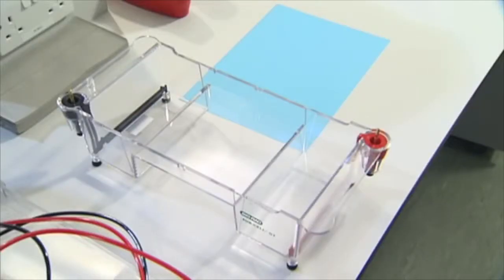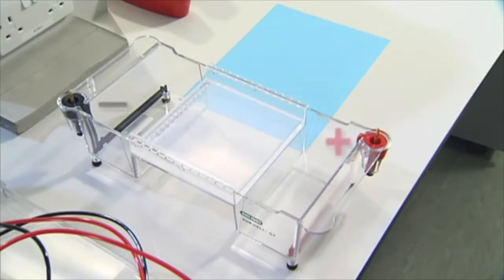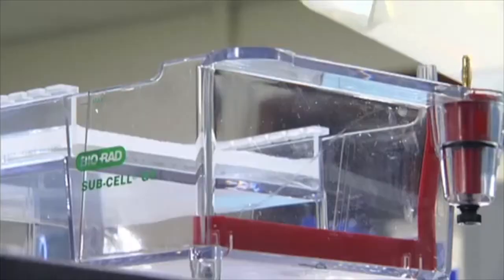Gel electrophoresis is created by an agarose TAE solution that is dissolved by a heated buffer mixture with the well mold. Once it's solidified, the gel is loaded into the electrophoresis chamber. The wells should face closer to the negative charge side of the chamber. Once the buffer is poured into the chamber, covering the gel about 2 millimeters above the wells, the substance can be micropipetted into the wells.